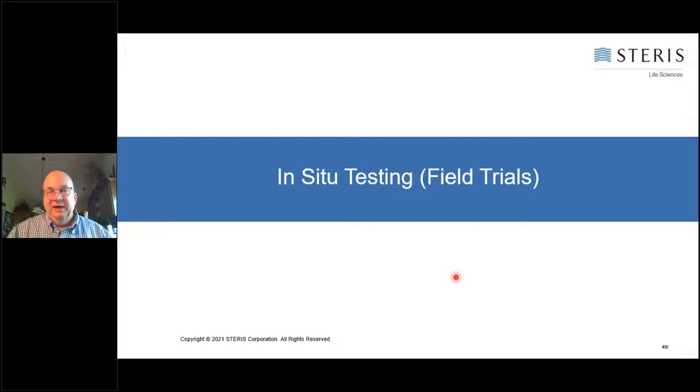So Thomas Arista from FDA, who runs the FDA field office there in India, or you look at John Metcalf from FDA, or Sharon Toma from FDA, or Andy Hopkins, who used to be with MHRA. Any of these global regulators will tell you that this kind of data is absolutely critical to showing them really how efficacious and effective overall your cleaning and disinfection and validation program really is.